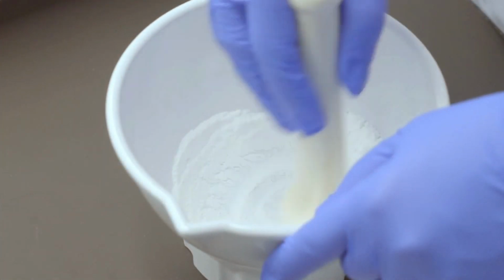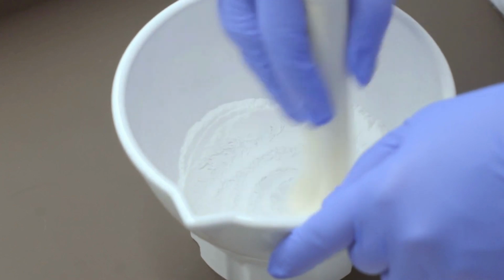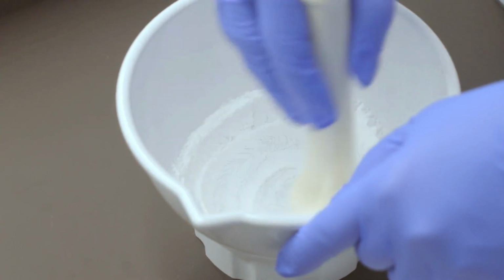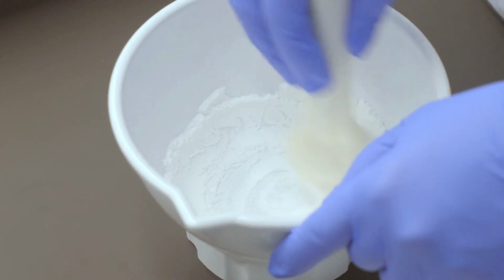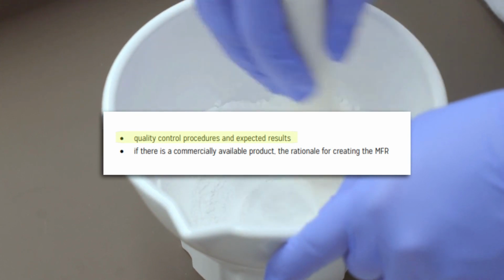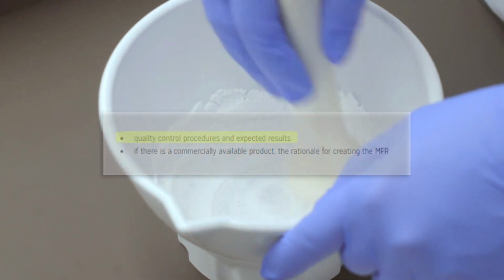Another example of a quality control procedure would be visual inspection of the final product and label to ensure they match the description and information in the MFR. Some compounds may require pH to be checked, and this requirement would be included in this section. Each pharmacy may have different quality control procedures in place, and that's okay. Documentation of the results of the quality control procedures needs to be recorded on the compounding record for each individual prescription. These quality control procedures can catch errors after the MFR is developed, but before the product reaches the patient.